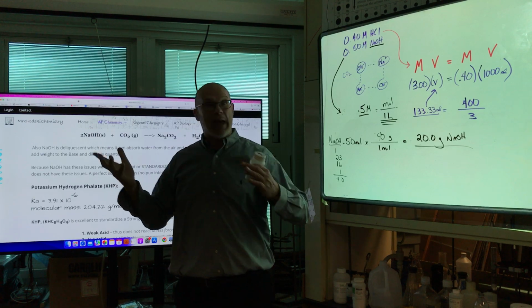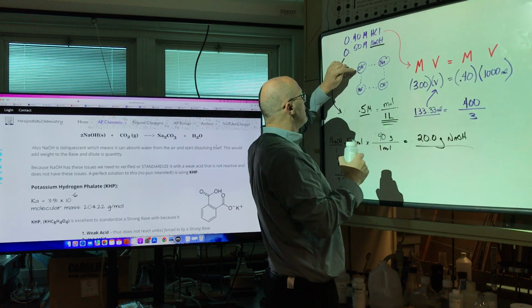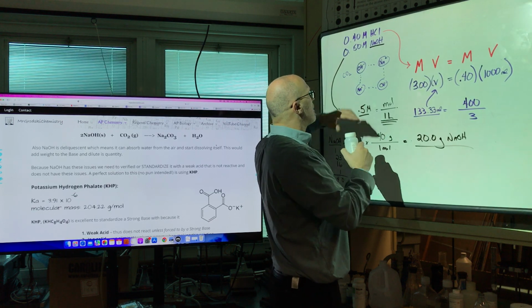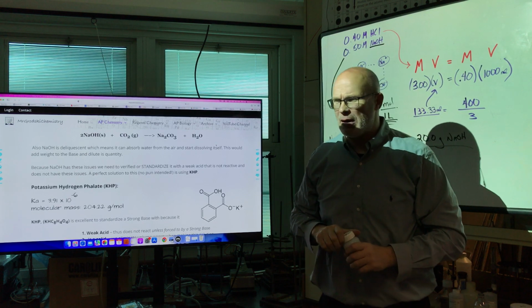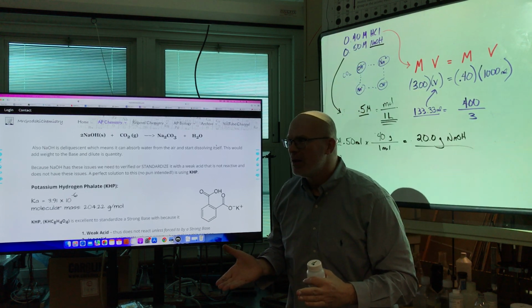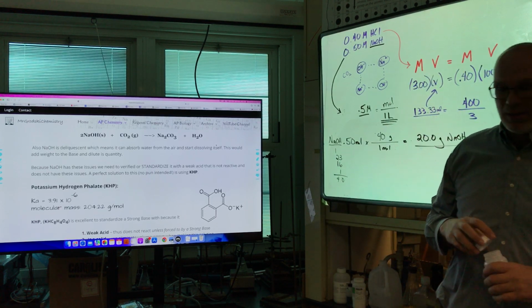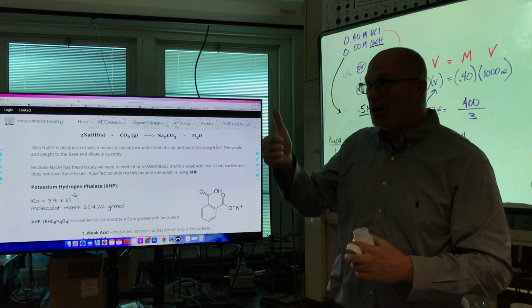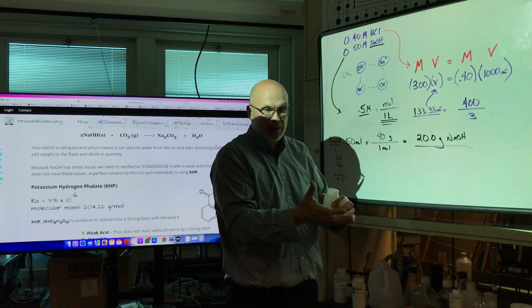Water vapor, or gas, will arbitrarily hit this hydroxide, and it'll absorb it into the crystal and make it a kind of wet hydrate. So its mass is what? Increasing, all right? And it'll react with the water a little bit. So if the mass increases, its molarity is going to drop, right? Because I think it's a certain mass of hydroxide.